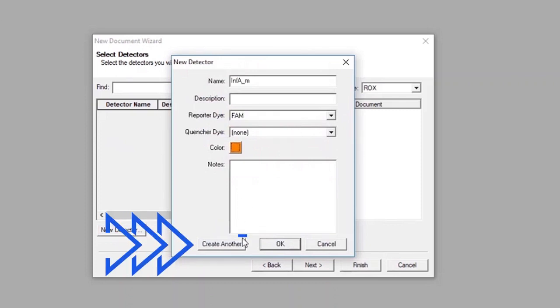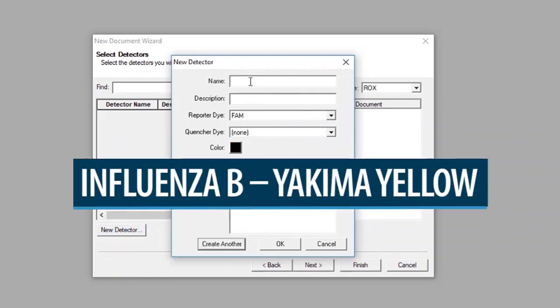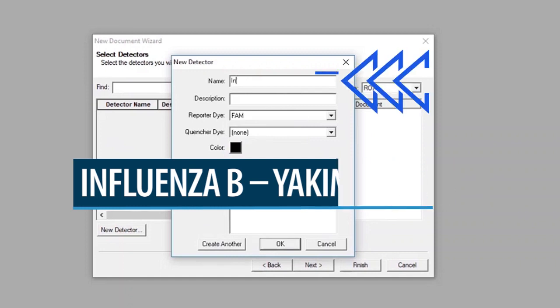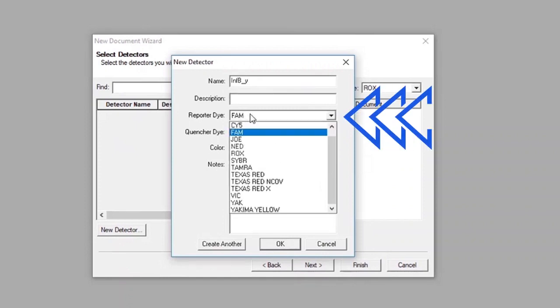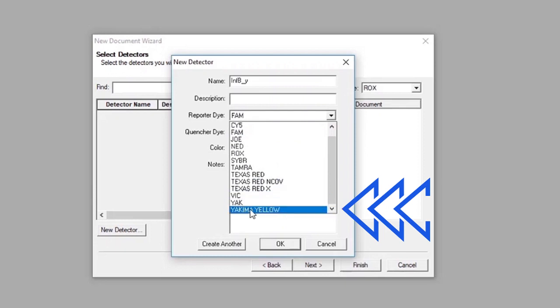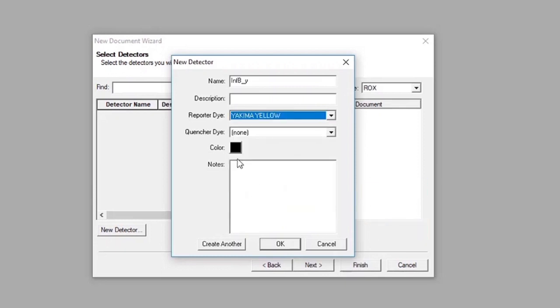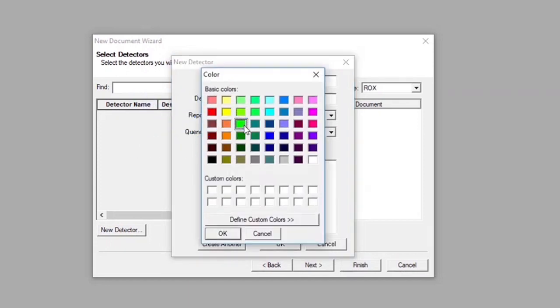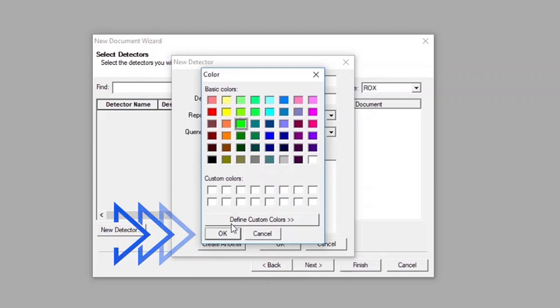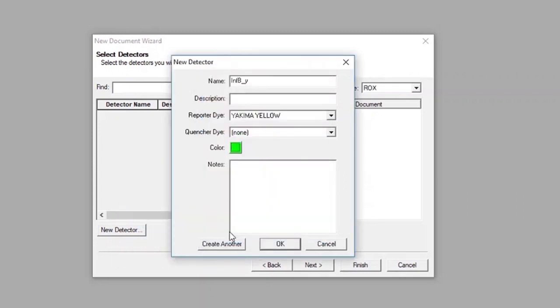To create another detector, click the Create Another button. To create the Influenza B Yakima Yellow detector, type INF_B into the Name box. Leave the Description box blank. Set the Reporter dye to Yakima Yellow, but leave the Quencher dye set to None. Select green as the color of the INF_B detector indicator, and click OK to return to the New Detector screen.